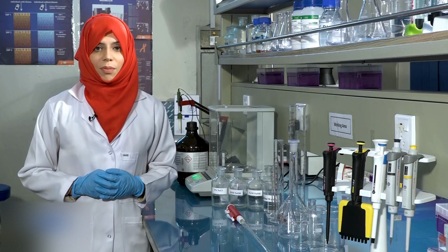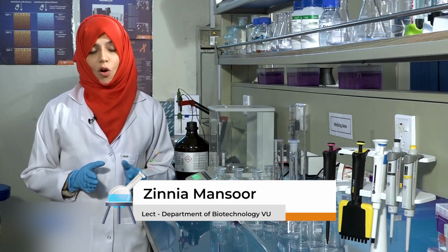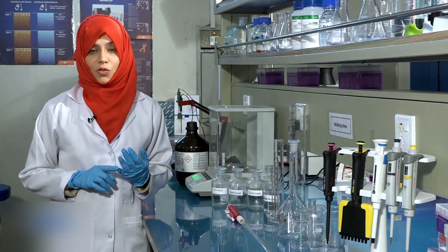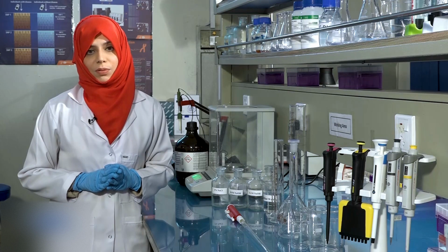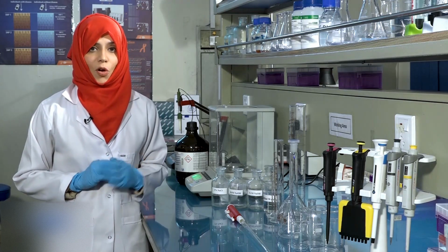Dear students, most of the reagents used in the scientific laboratory are in the form of solutions that need to be prepared or purchased. For some cases, the exact concentration of the solution is not important, while for other cases, the concentration and the method of preparation of the solution needs to be as accurate as possible. Today, we will learn how to make solutions in the laboratory.